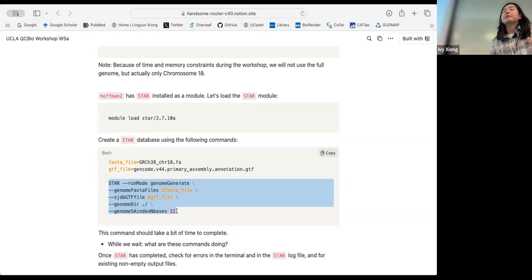How about the two lines before that? You can even copy the whole thing and then paste it. It doesn't matter. The command line is fast enough to respond. Yeah, just copy the whole thing, paste it in the command line. It should be good.